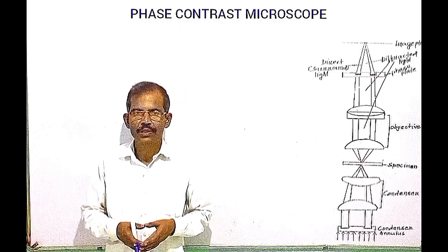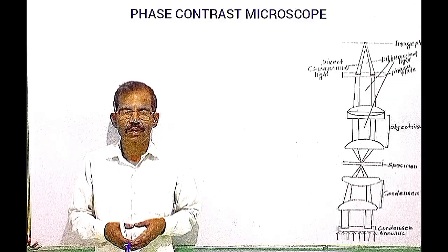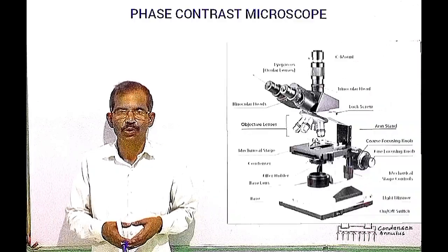Today we will discuss the principle and applications of the phase contrast microscope.